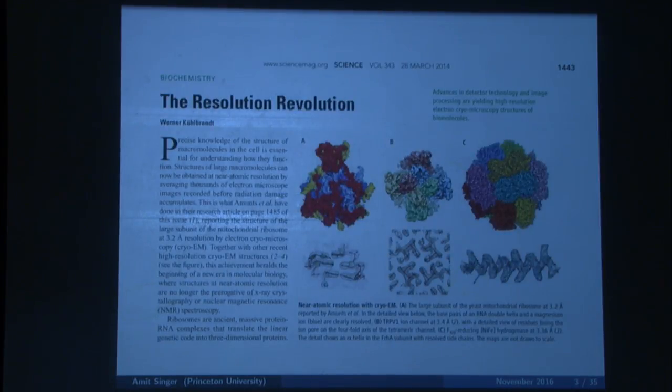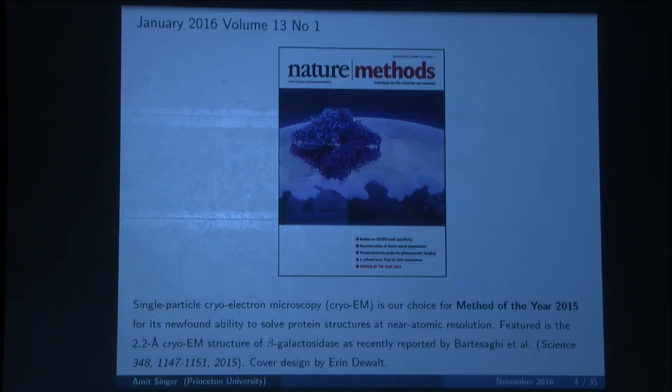Or a couple of years ago in Science, the resolution revolution. And again, you can read closely: together with other recent high-resolution cryo-EM structures, this achievement heralds the beginning of a new era in molecular biology, where structures at near-atomic resolution are no longer the prerogative of X-ray crystallography or nuclear magnetic resonance spectroscopy. And just earlier this year, cryo-electron microscopy was chosen as method of the year.